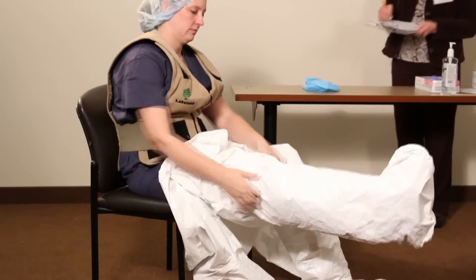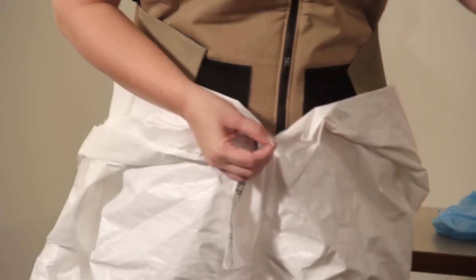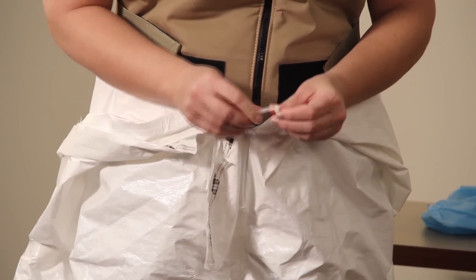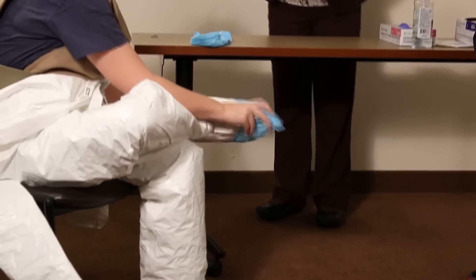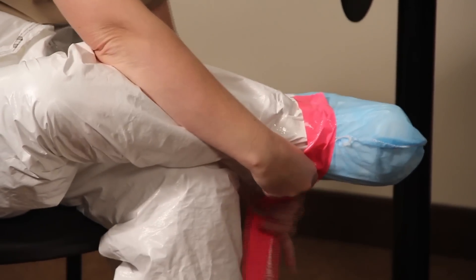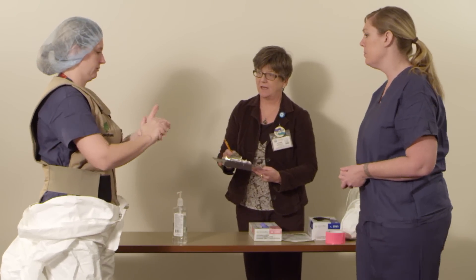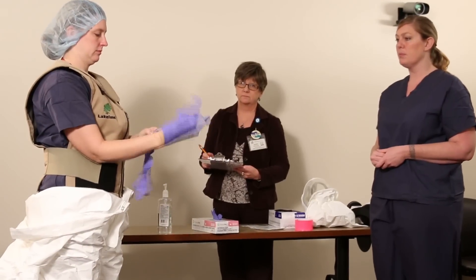Put on the Tychem SL suit and pull it up only to your waist. Add a zip cable tie to the zipper on the suit with a paper clip — your donning buddy may assist you with this. Place the shoe covers over your Tychem SL suit and tape them to the suit so that the shoe covers don't slip off. Then wash your hands. After that, don your first pair of gloves — these are the tight-fitting purple gloves.